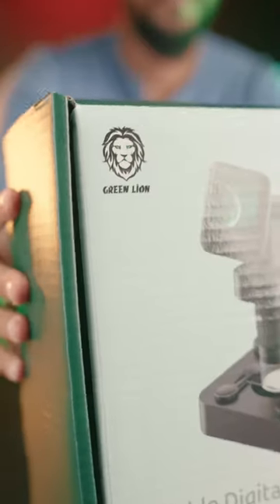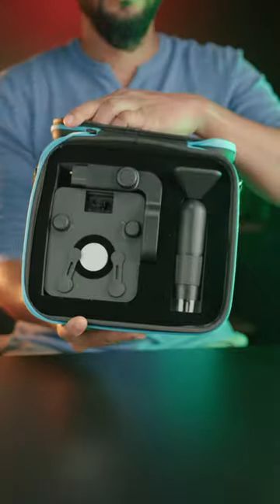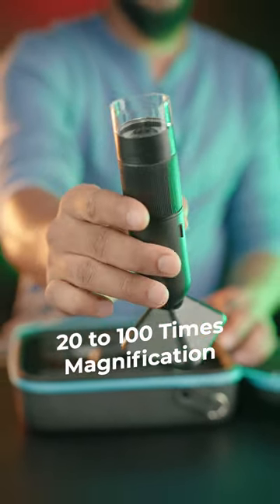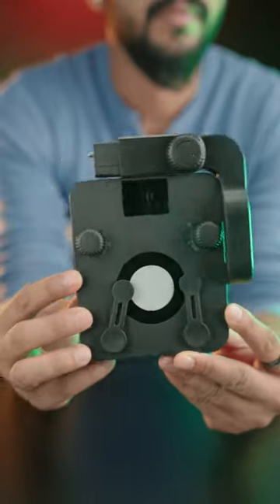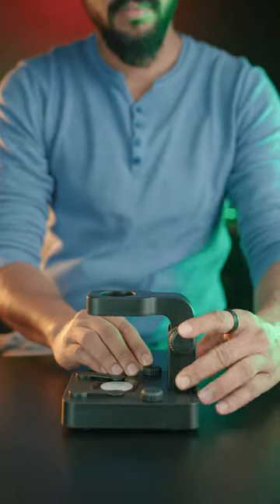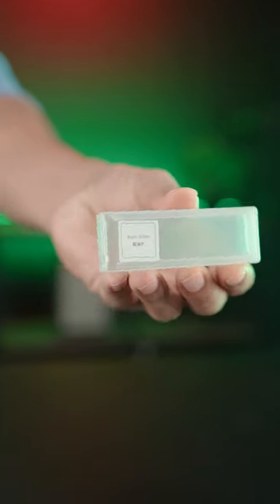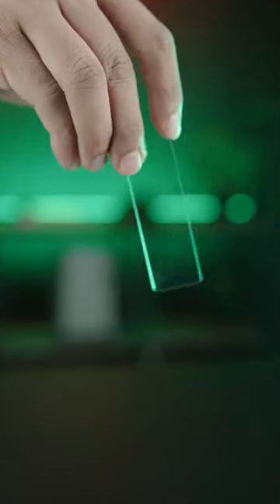Explore the microscope world with the new product from Green Lion. This is a portable microscope from Green Lion that offers 20 to 100 times magnification. All the contents are housed in a very sturdy case, along with a laboratory pack that includes related equipment and several slides.